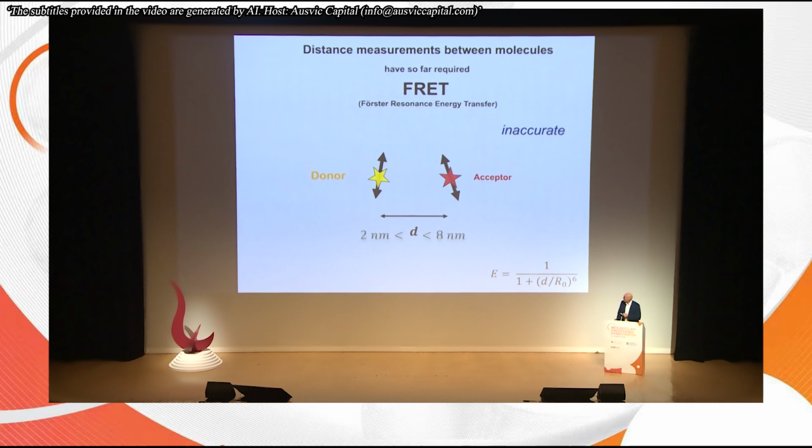In addition, of course, this distance is inferred from a law that scales with the 6th power of the distance. So the energy transfer scales inversely with the 6th power of the distance. So it's a very nonlinear function.